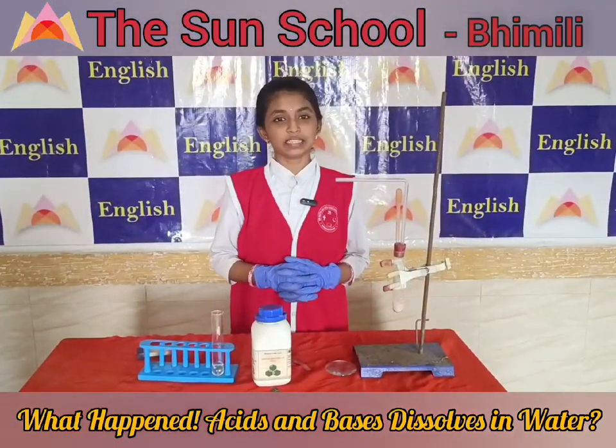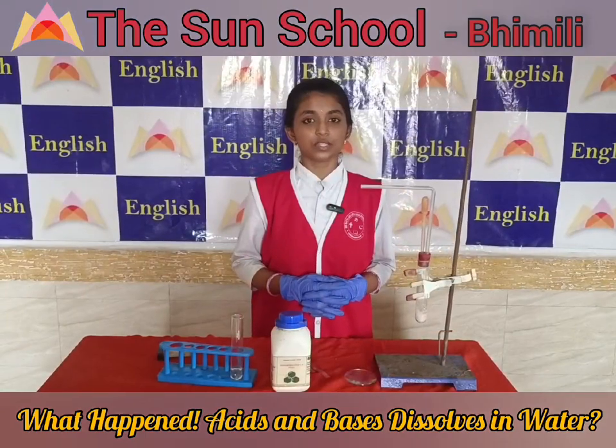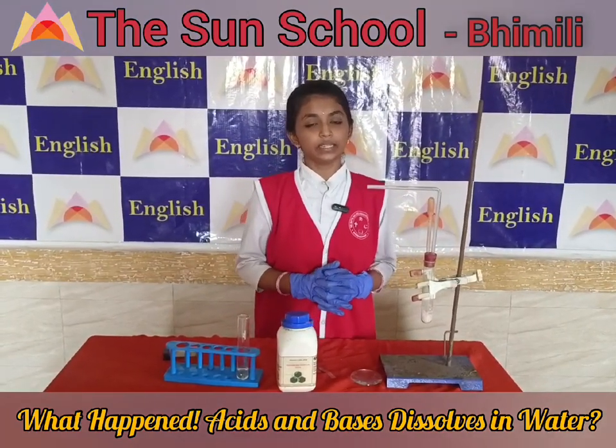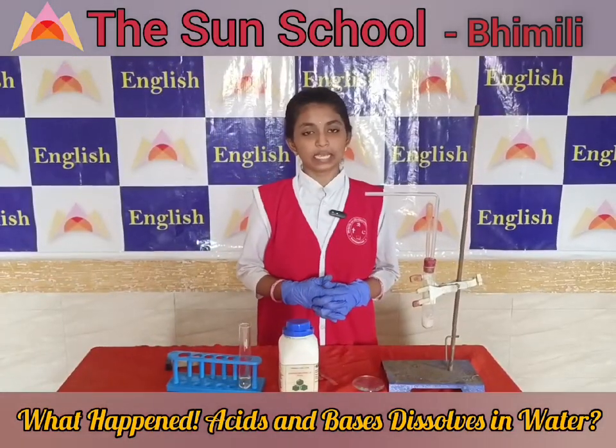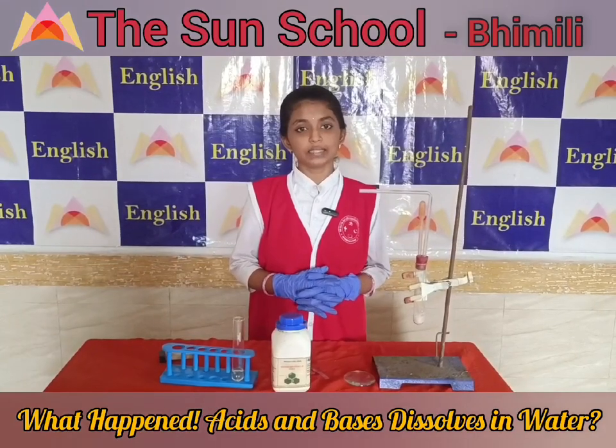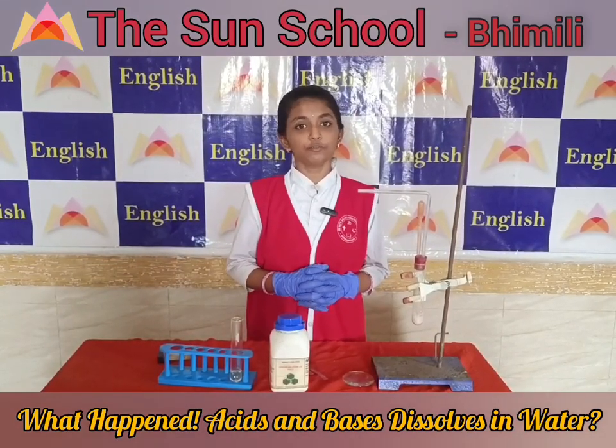The released gas is in the dry state. When this gas dissolves in the water content of the wet blue litmus paper, it turns red. From this we can say that the released gas has acidic nature. From this we conclude that acids and bases dissolve in water to form ions.